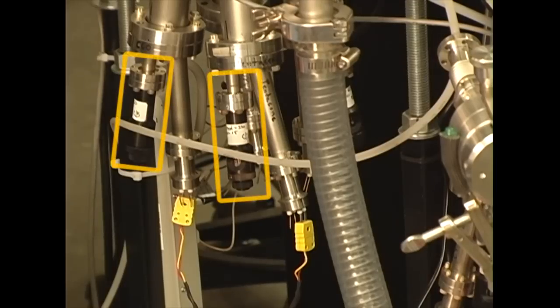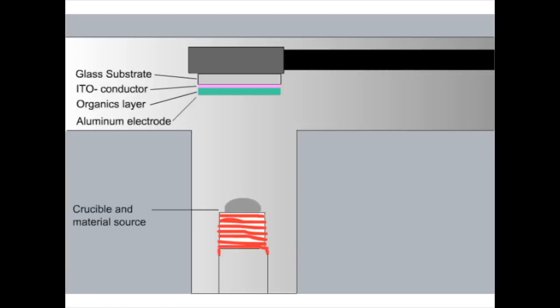The crucibles are then inserted into the vacuum chamber and sealed. During deposition, aluminum is heated and atoms fly off, coating the inside of the chamber and the device. The source is slowly being used up in the process.